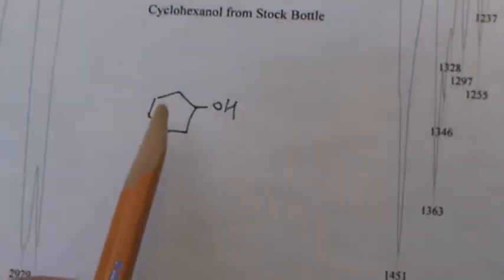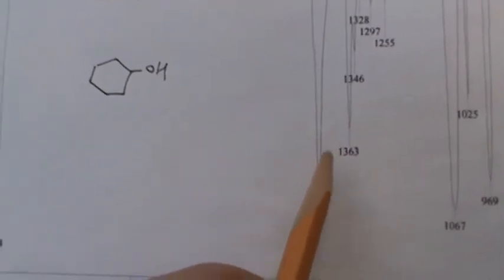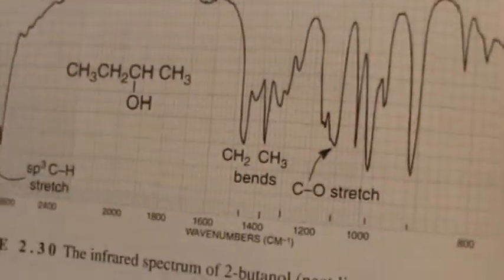So that makes sense. The only other thing you could, for this one, there's no aromatic, there's no carbon-carbon double bond. So obviously, this type of stuff right here has to be a carbon-hydrogen bend, an actual bend. Now, do you see how what he's done in his book in that region? Now, he's not necessarily circled anything. If you want to learn more about it, we can back the train up here to the alkane section and look at what they've done there.